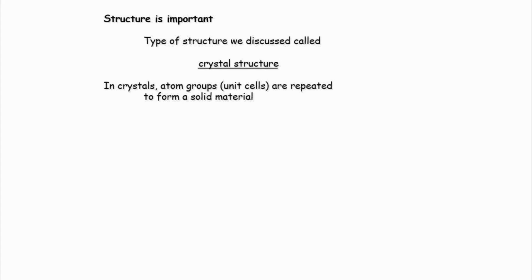If you can imagine this, we'll take this one unit cell, one unit part of the lattice in the crystal, and understand the structure of the lattice. Once we know the structure of the lattice, it is much easier for us to decipher information from one single unit, and then keep on pulling the data from other units and get the entire structural elucidation done, right? So yes, obviously it's important for materials, and the advantage you have in a crystal is that you have a repeating unit.